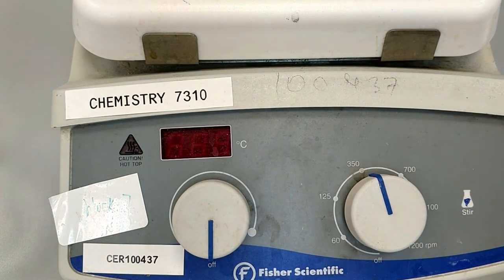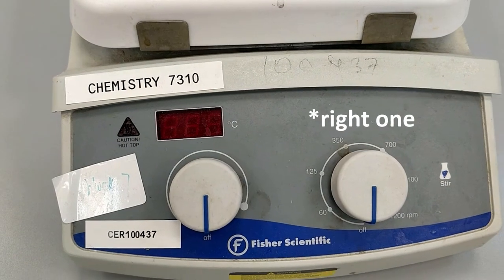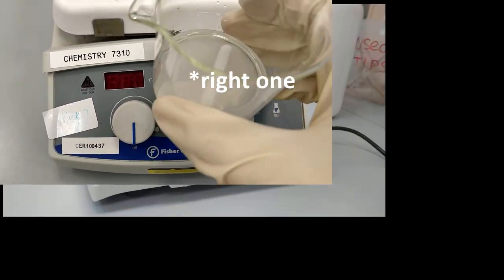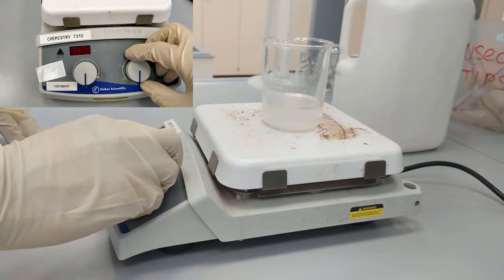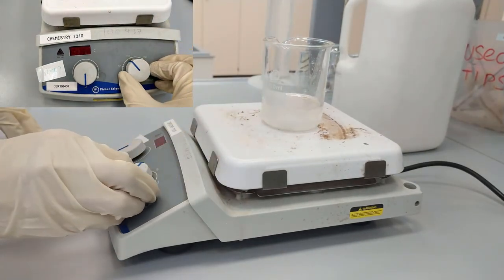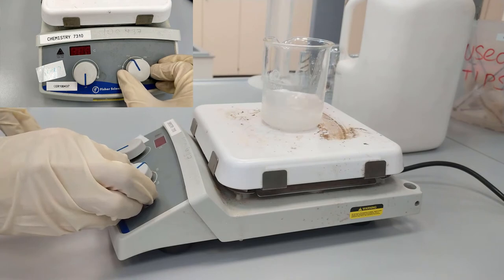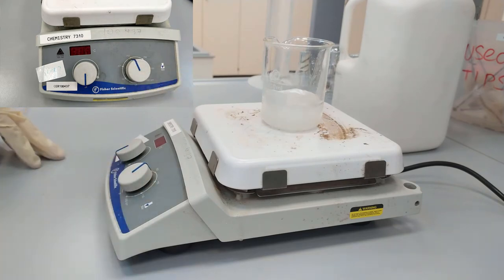And here you can see the two knobs. The left one shows the temperature, so it is the heater. The right one shows the RPMs or rotations per minute. So you place the beaker on the stirrer and set the appropriate rotations per minute.